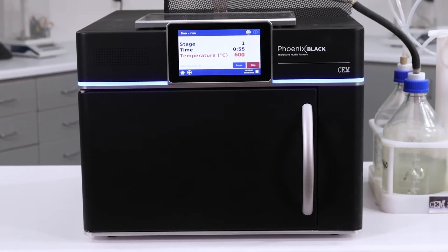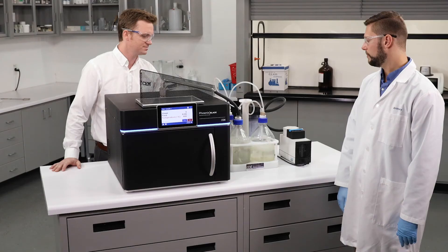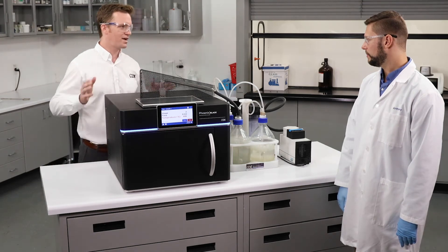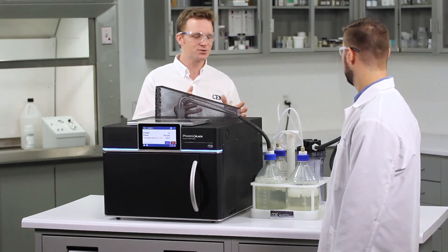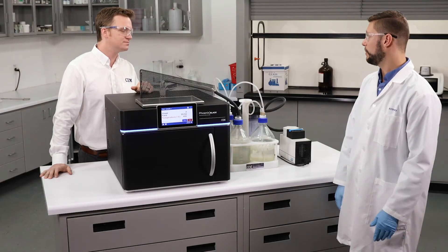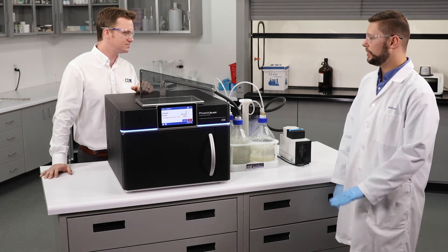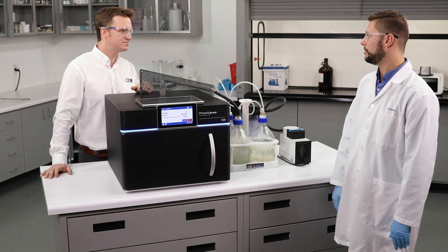I heard the vacuum pump just click off here and we've got no more bubbling going through that scrubber system, so where are we in the process? At this point the pump and scrubber system has turned off because all the acid has been boiled off — there's no more vapor to worry about, and we'll just allow the Phoenix Black to continue the ashing process until the sample is ashed to completion.